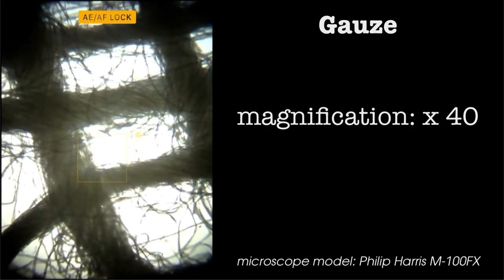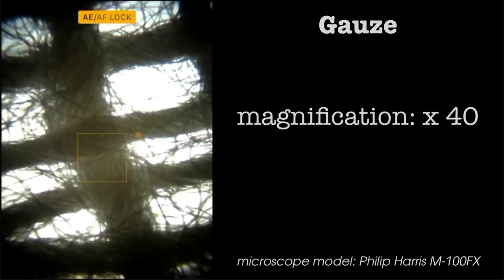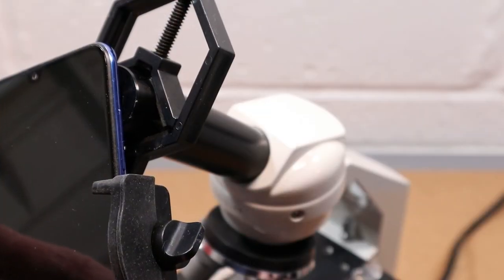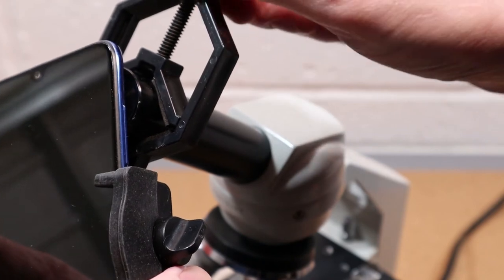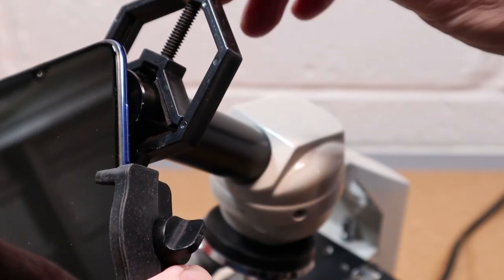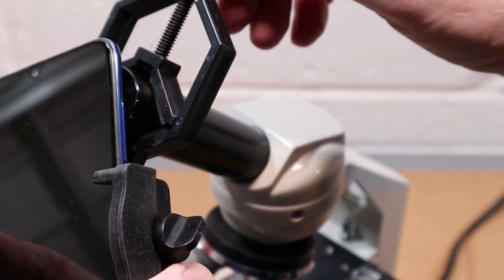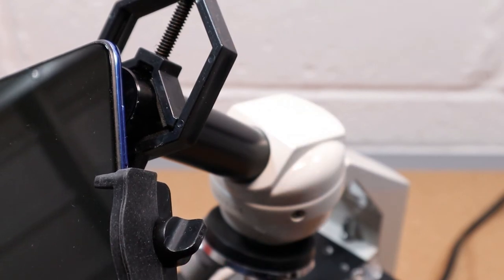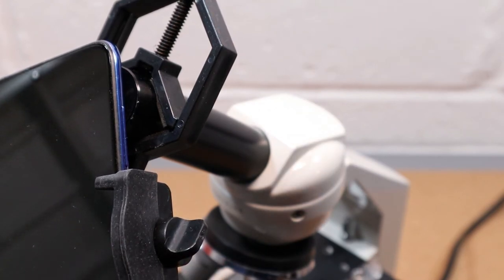So the adapter can be a bit fiddly at times, but I was able to get usable results from it. You can see in this shot that the foam pads on the eyepiece clamp compress when attached to the microscope's eyepiece, and once I let go of the phone it begins to move which makes getting the best images possible a little trickier.